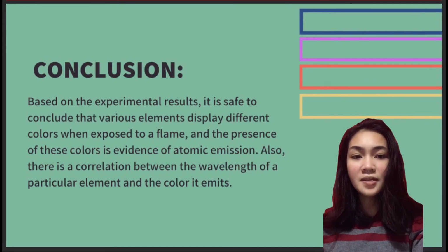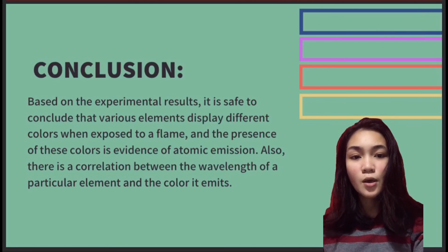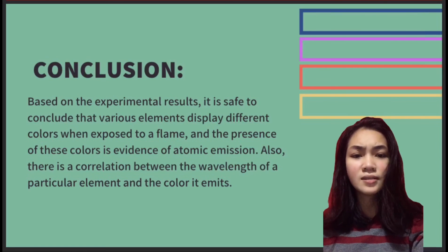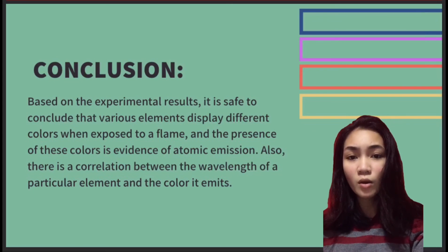Conclusion. Based on the experimental result, it is safe to conclude that various elements display different colors when exposed to a flame. And this presence of colors is evidence of atomic emission. Also, there is a correlation between the wavelength of a particular element and the color it emits.